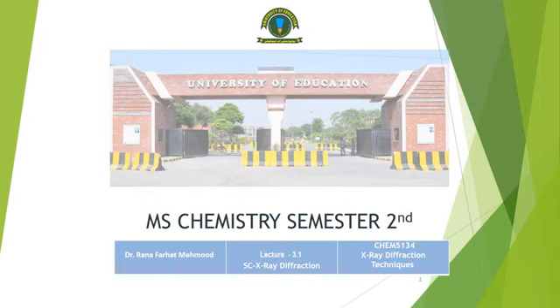Rana Farhat Mehmood, and today we are going to discuss our third chapter about the X-ray diffraction technique under the course code of Chem 5134. And this third chapter is about single crystal X-ray diffraction.